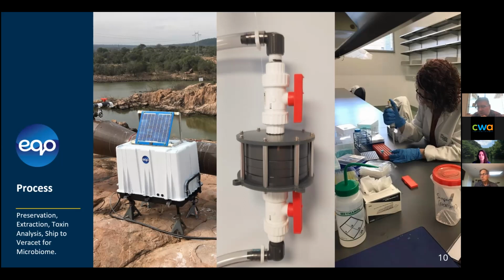And so we collect that, preserve it, and then we can take kind of an environmental snapshot of what genes are being expressed at the time. That allows us to understand what toxins are being expressed, what's alive, are there signals for breeding, all kinds of things that you can query the transcriptome, as we call it, to figure out what's going on at the time.